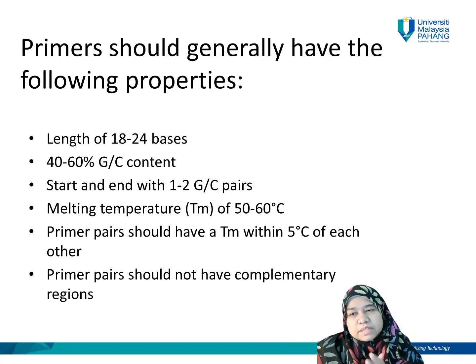If you first design the primer and find that the GC content is too low, you should add more G and C in your primer without causing any mutation in your primer. We already discussed a little bit here in the class before.